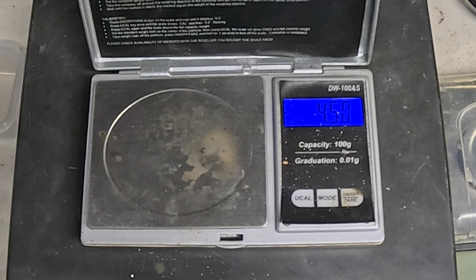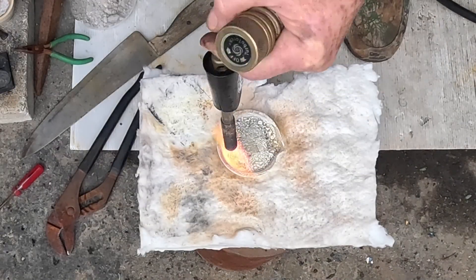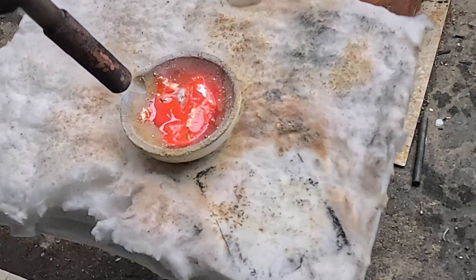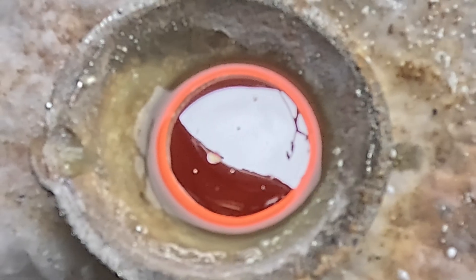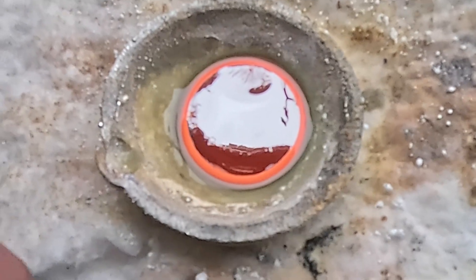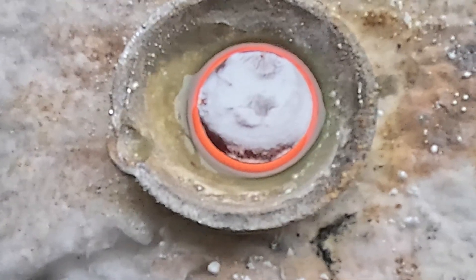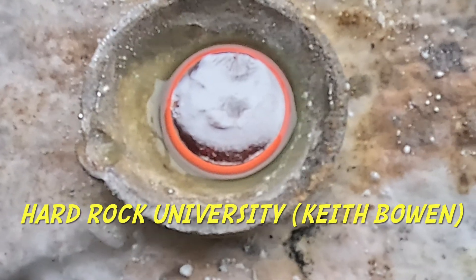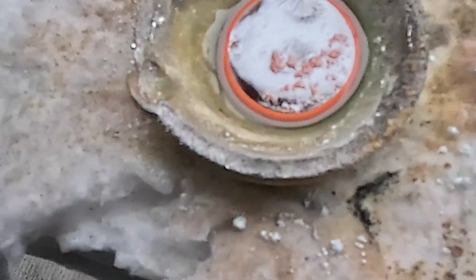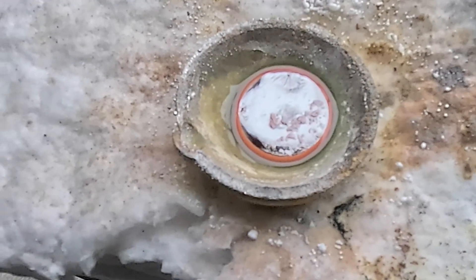Stick that right back in there. So yeah, there we have it. All right, let's go melt that thing. Don't touch anything for a couple of moments. Keith Bowman asked me if my fingers are insensitive to heat — I'm like no, but you can touch anything for a second. You could touch the surface of the sun for a couple microseconds if you can get close enough and fast enough. All right, let's set up there pretty good.